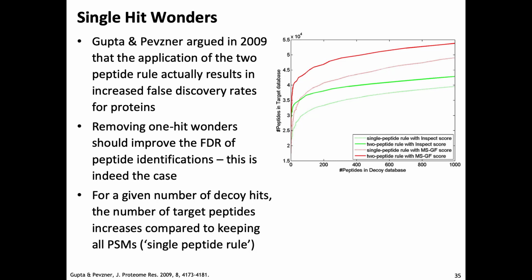If you measure the spectrum again, the spectrum will be different, and you will actually match a different protein randomly. The odds of hitting the same protein over and over again is only high for true identifications, not for the incorrect identifications. They will be all over the place.